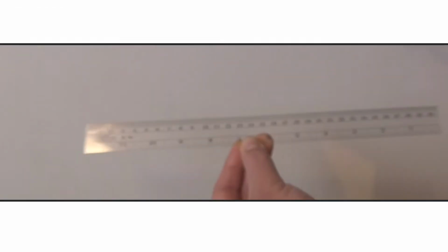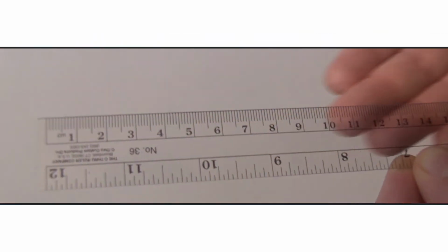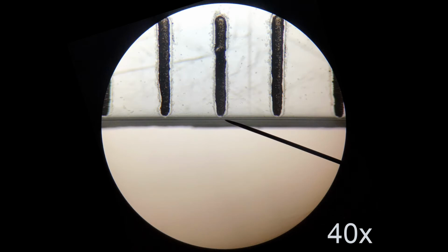Well, we need a ruler. What we're going to do is take a clear ruler and put it under the microscope at 40x, and we're able to see 1, 2, 3, 4 millimeters, which tells us that the field of view at 40x magnification is 4 millimeters.